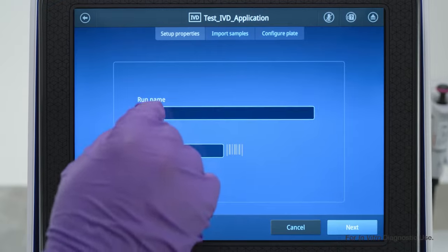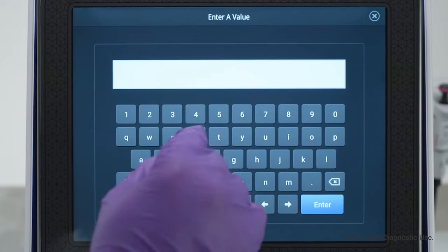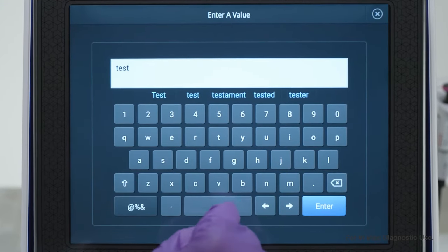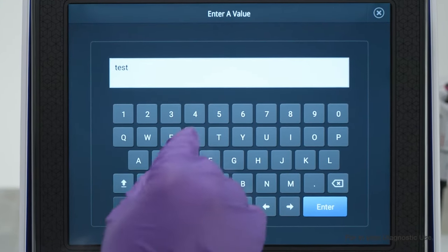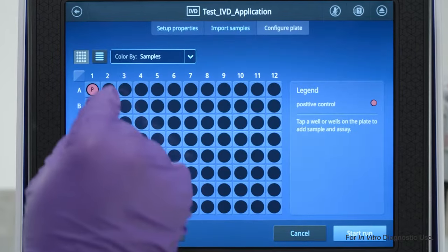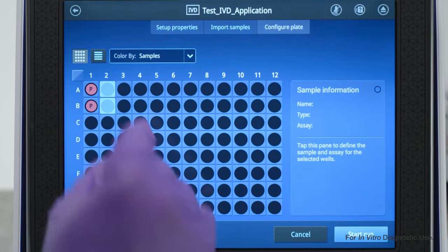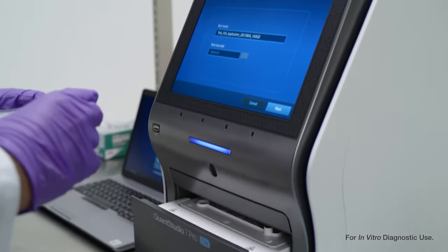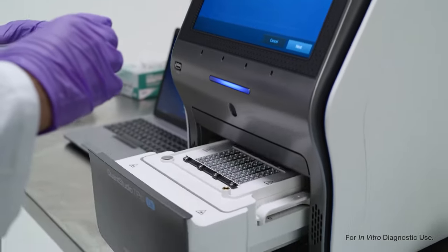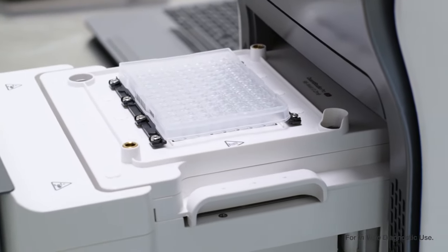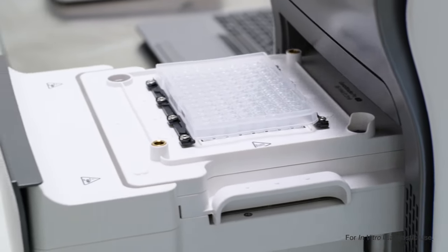Once the ADF is ready, you can set up your plate via the easy-to-use instrument interface. You can even import pre-made sample files for faster configuration. Simply scan the plate and reagent barcodes to track their information.